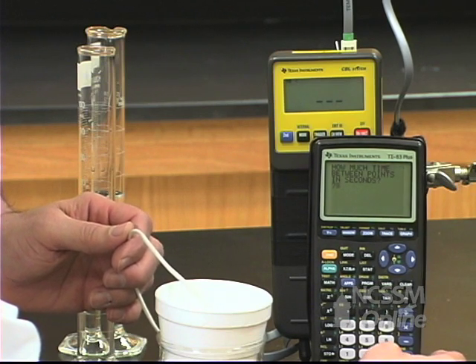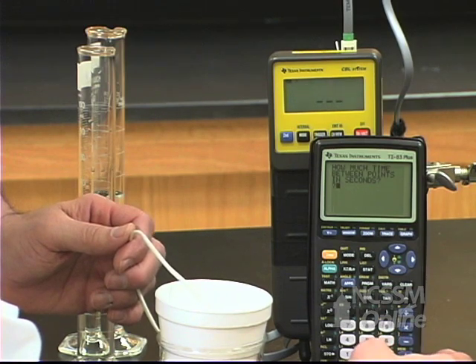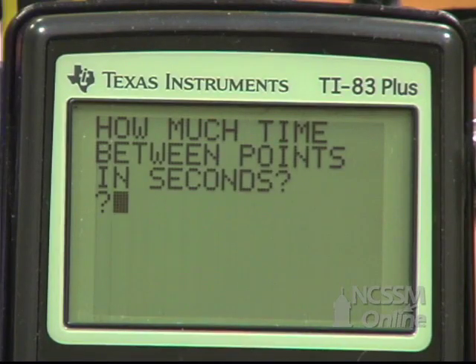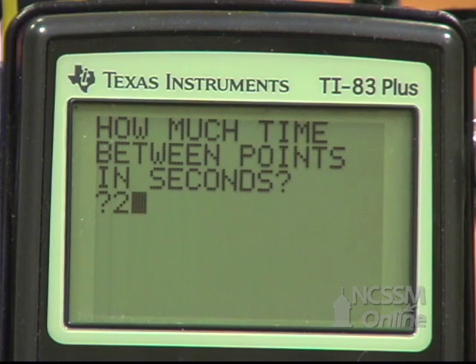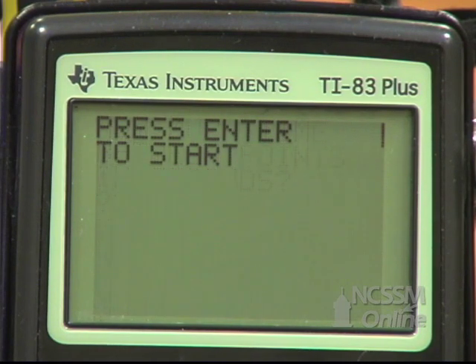It's going to ask you how many data points, how many seconds between data points. You're going to enter 2. It's going to say press enter to start.